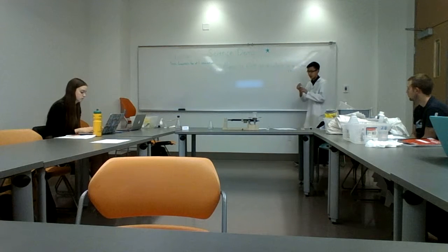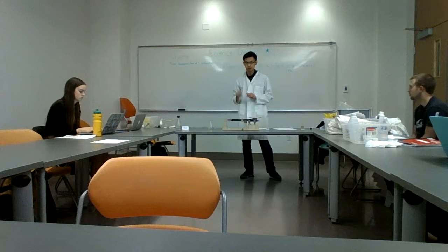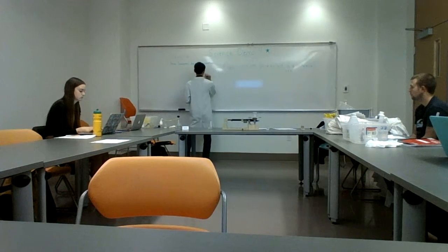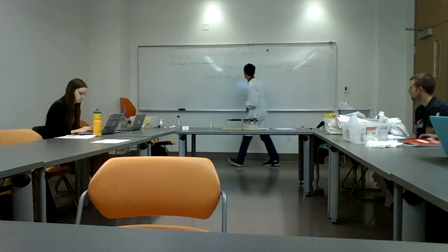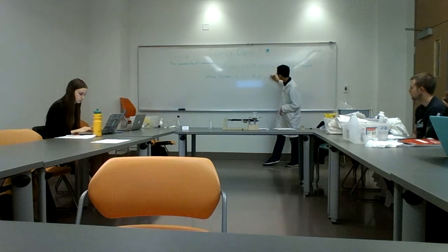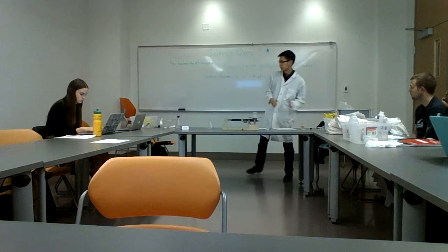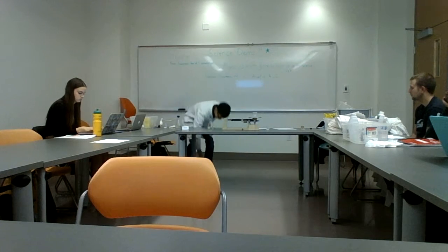Okay? So to prove it, we're going to do a science demo involving two chemicals. Chemical number one is called sodium bicarbonate. And then our second chemical is acetic acid. So we are playing around with acid here, so it's important for us to be careful and follow the proper procedures. And I will have lab bottles here.